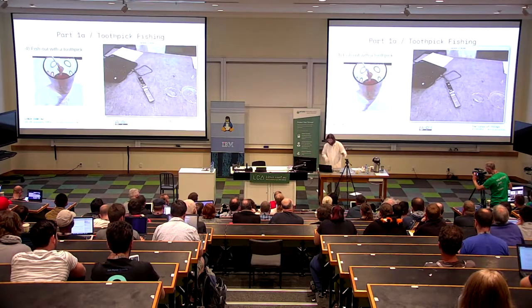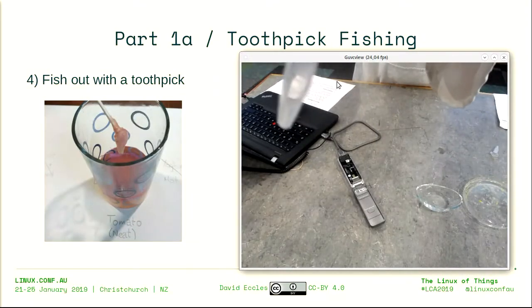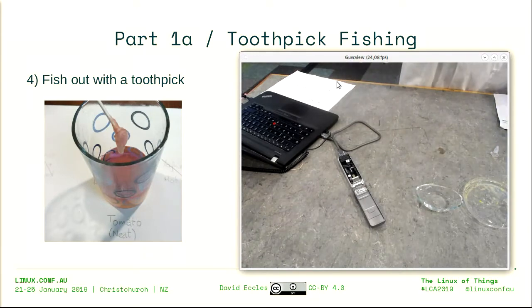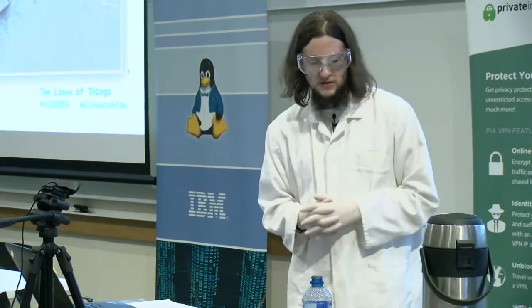So, there we have it. Some sort of whitish liquid, hopefully containing slightly purified DNA. Okay, now it's time to start using some commercially produced sequencing kits.